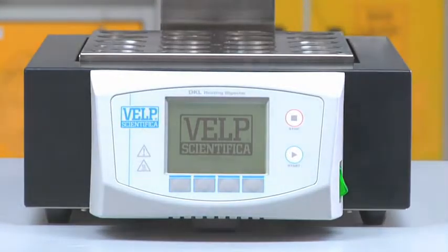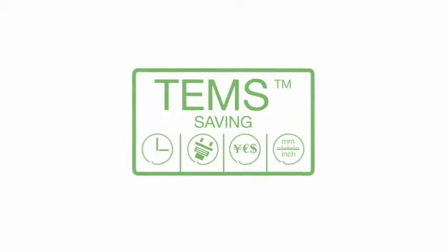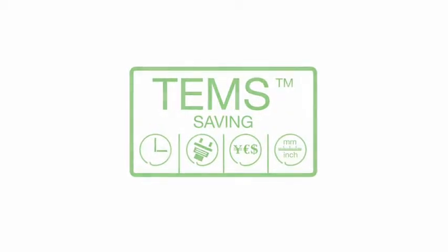The DKL Series incorporates the exclusive TEMS technology for conspicuous savings in terms of time, energy, money, and space.